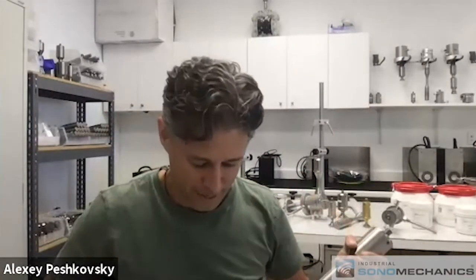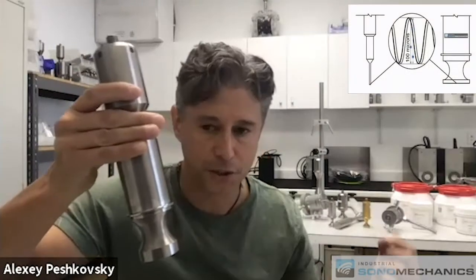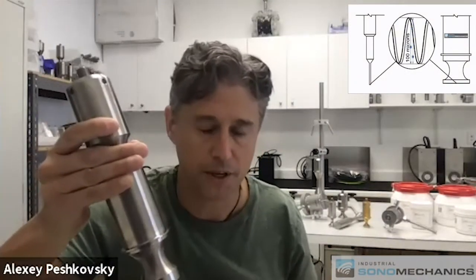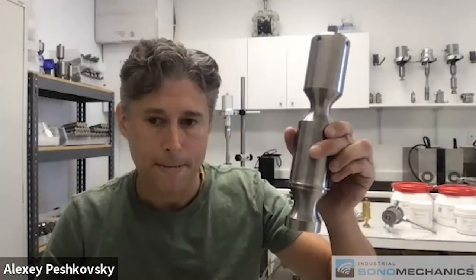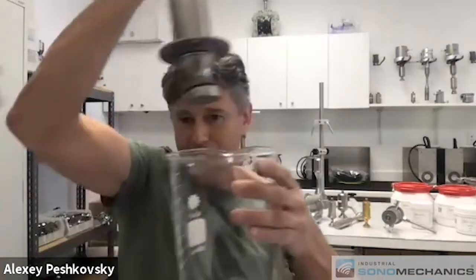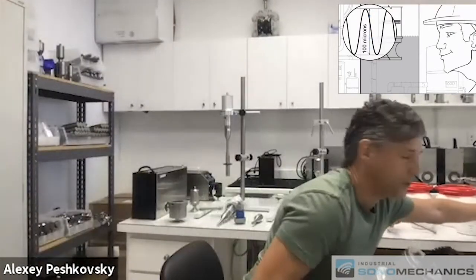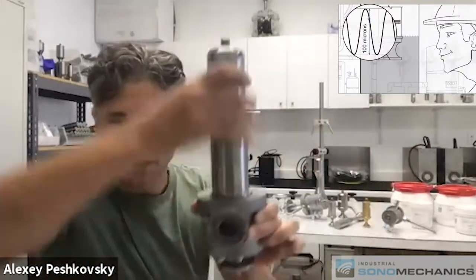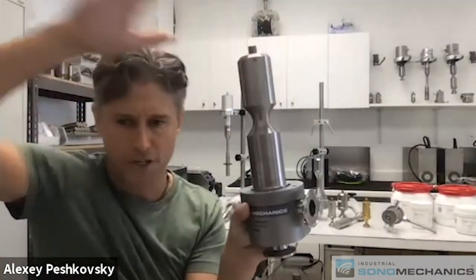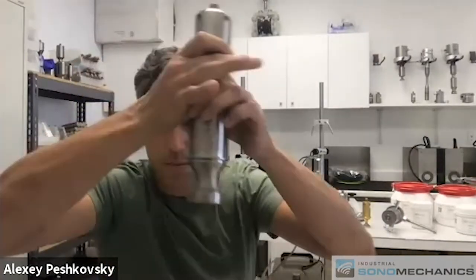To scale up from there, you'd go to a horn like this — a much larger device. The scale-up factor between this one and the small conventional devices is easily on the order of 60. So if you process something for an hour and get the result you want, with this one it'll be one minute. This combines the batch capability and the flow-through capability all at the same time. It could fit into a much larger beaker, but typically you'd use it directly in a larger tank or in a reactive chamber with a heat exchanger, a much larger tank, and a pump.